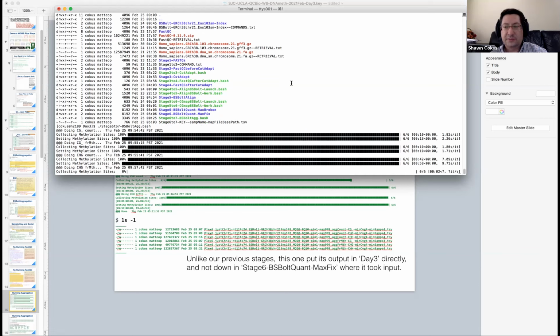There is a way to do jobs in the background interactively, but we get into so much, I didn't want to add yet another kind of shellism. It would take a little bit to really explain how background, foreground job control works in the shell. So yeah, we would forgo the progress bar, but we could have run this in a way that would have given us our shell prompt back while this thing worked, even though we're running it interactively. But we just didn't do that. We rather had the progress bar.